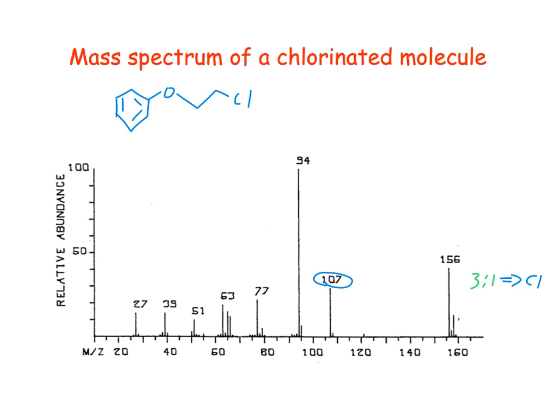Okay, so this is going to be a loss of... Yeah, probably the chlorine with the CH2. Okay, so where is it going to ionize to do this cleavage? On the oxygen, yeah. All right, so if we draw it this way, that goes over to that carbon.